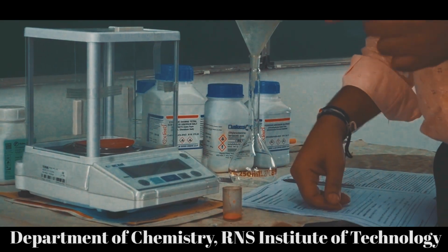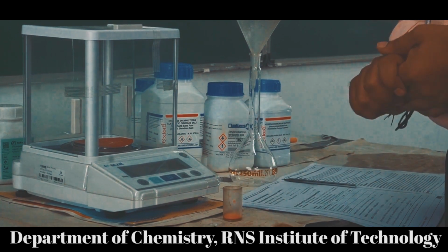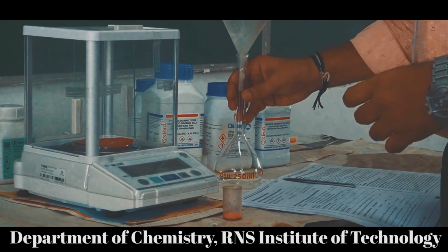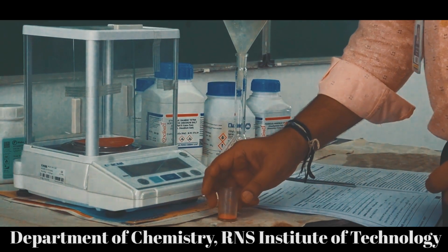As I already mentioned, there are 2 steps in this experiment. The first step is the preparation of standard K2Cr2O7 solution. In order to prepare that, you have to wash the standard flask and funnel and come along with your manual. Here they will be keeping these K2Cr2O7 crystals. So you have to take the salt weight.